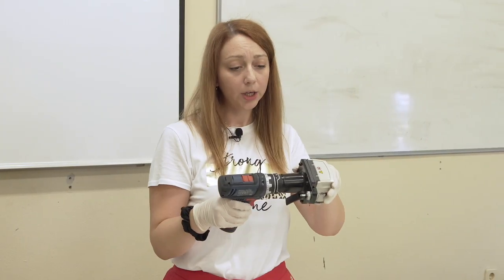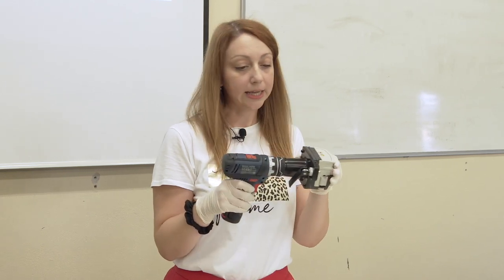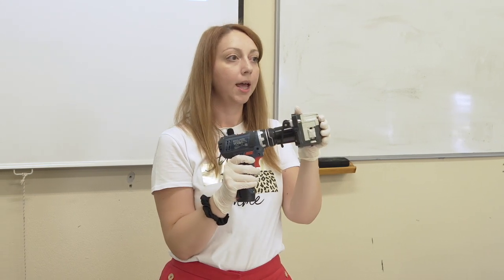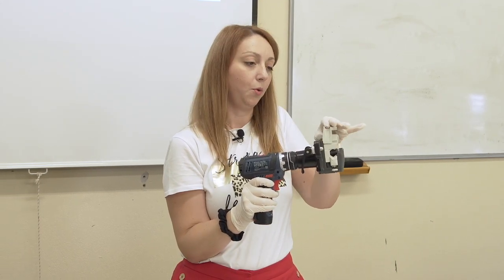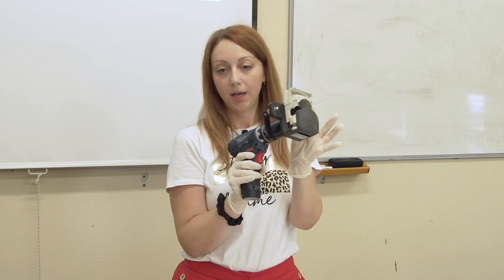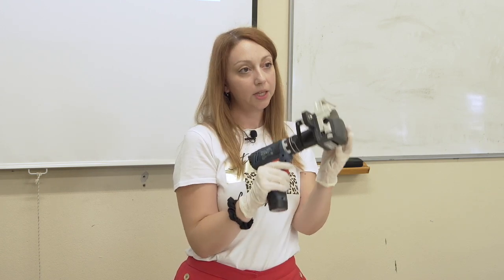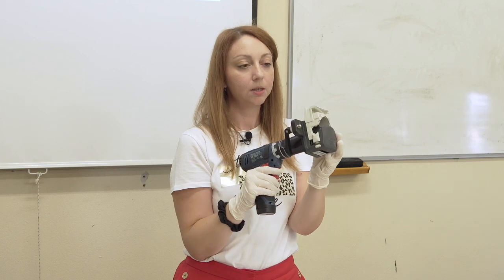Today I will present to you the vampire sampler, which is this one. This is a peristaltic pump. We have the drive unit, the pump unit, and we put the hose in this hole. It provides many advantages because it is portable. We can handle it very easily and carry it to the field.